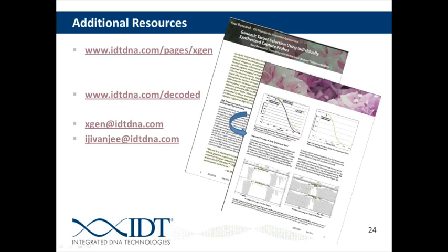The first question, Ibrahim, is does IDT have any of their own exome capture panels? We do not have our own exome capture panel at this point. We encourage customers to work with the panels that are available commercially today. Those panels will definitely have holes in them or coverage gaps, and we encourage customers to fill in those gaps with our lockdown probes.